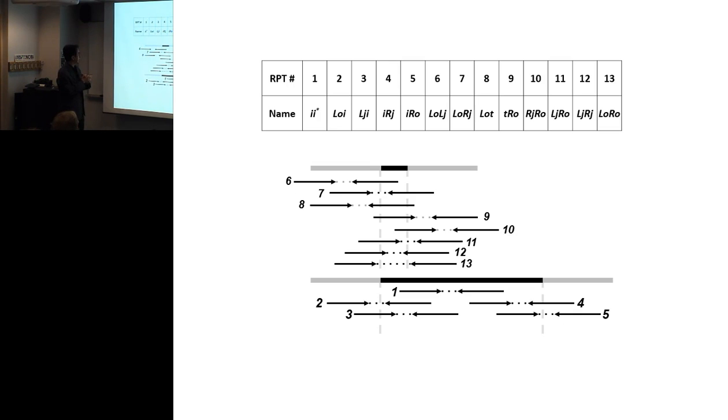Okay, so Brian, we are talking about having Illumina short read data. When a short tandem repeat gets expanded to a longer length, we define read types: outside, junction, inside, right junction, or outside. If we build a dictionary of possible read pair types, RPTs, we have 13 kinds. The information we can extract is the relative abundance of the 13 types. They will tell us whether we have two short STRs, or short and long, or long and long, and how long it might be. So that is the heart of the technology. That's the information we want to uncover.